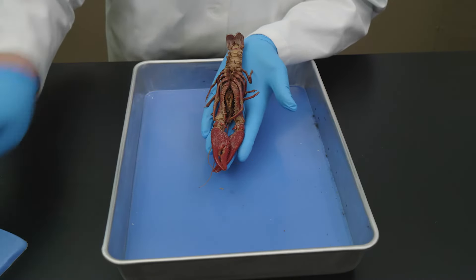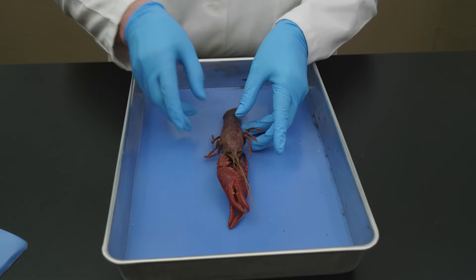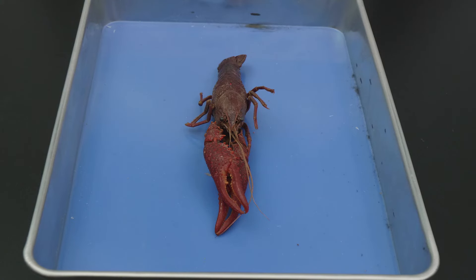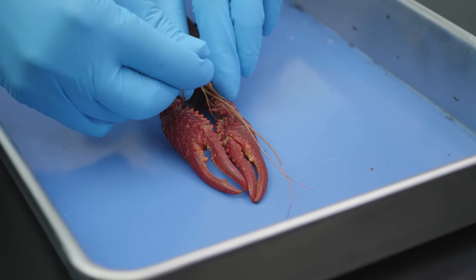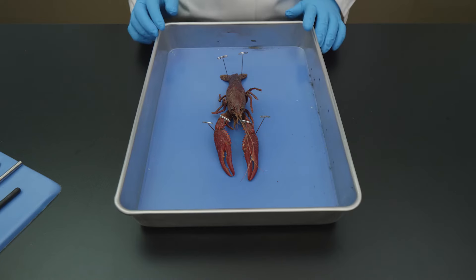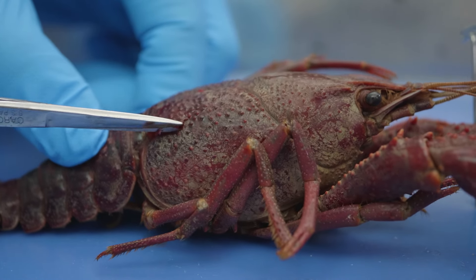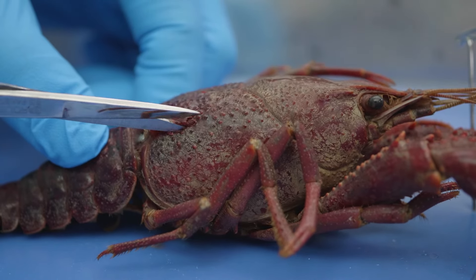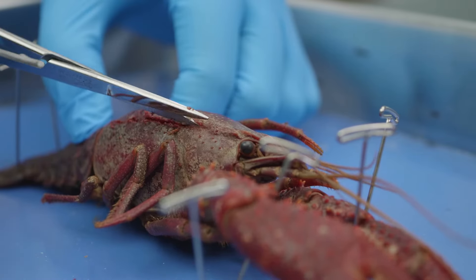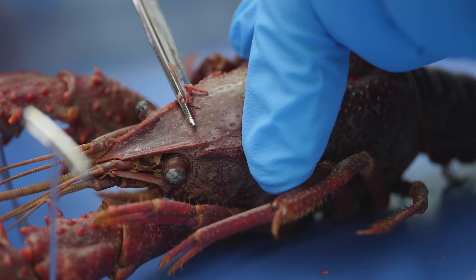Now that we have examined the external anatomy of the crayfish, let's turn our attention to the internal anatomy. To see the internal organs, we need to remove a portion of the carapace. We use pins to hold the specimen in place while we make the incisions. After the crayfish is secure, we insert the point of the scissors into the joint between the cephalothorax and the abdomen, and then make an incision along the side of the cephalothorax up into the rostrum.